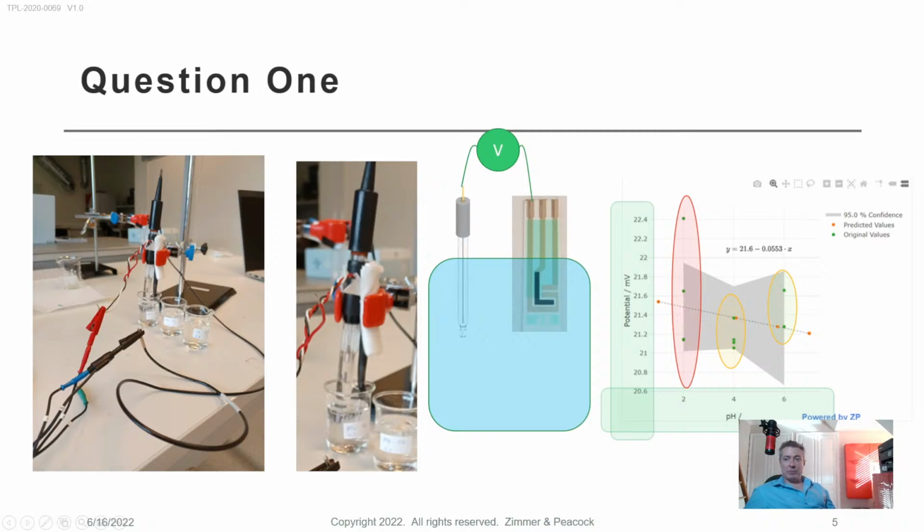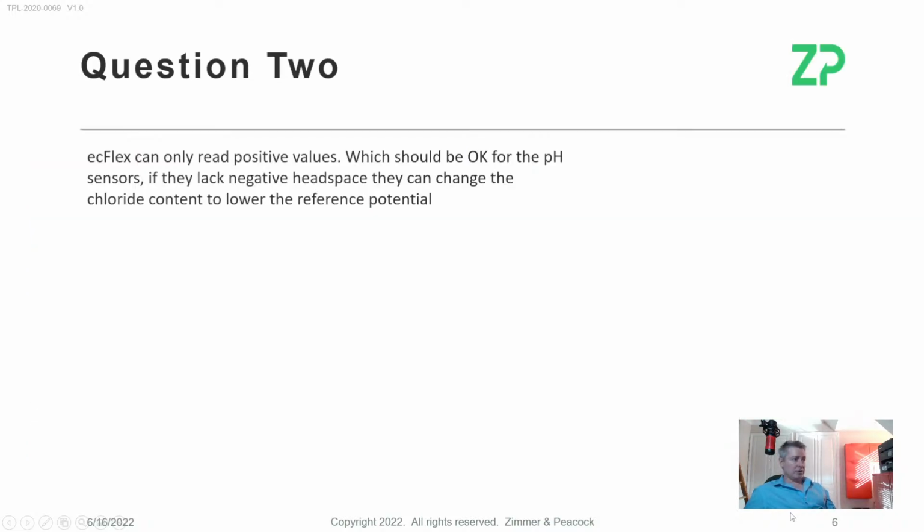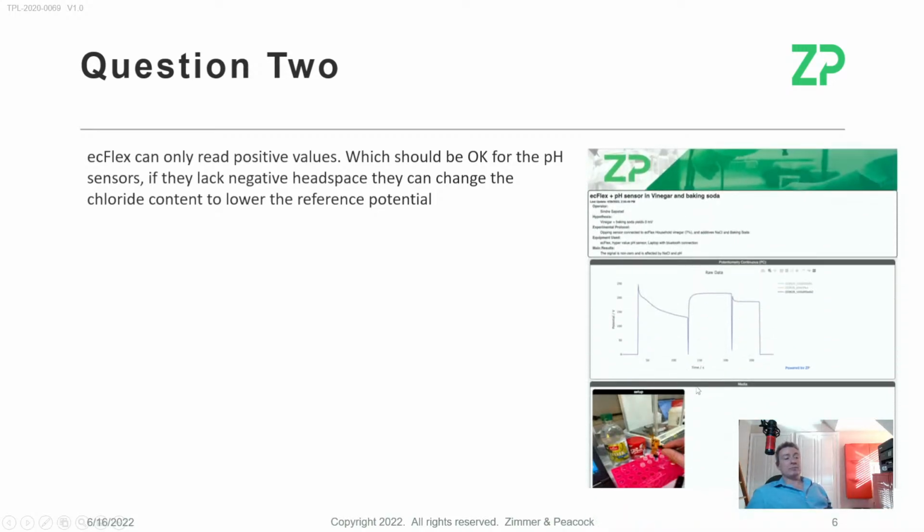All right, so that was question number 1. All right, question number 2. This is an interesting one. This arrived on our plate a few weeks ago, and the question at the time was, we've got your ecFLEX, we've got a pH sensor, and we're trying to measure. They were trying to test with vinegar and sodium bicarbonate. So we actually ended up doing that work ourselves. I'll bring this back a few times.